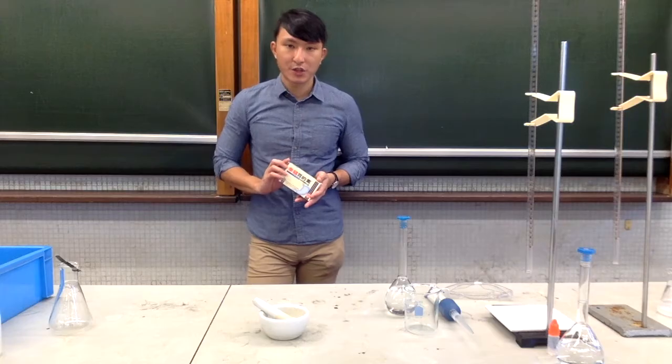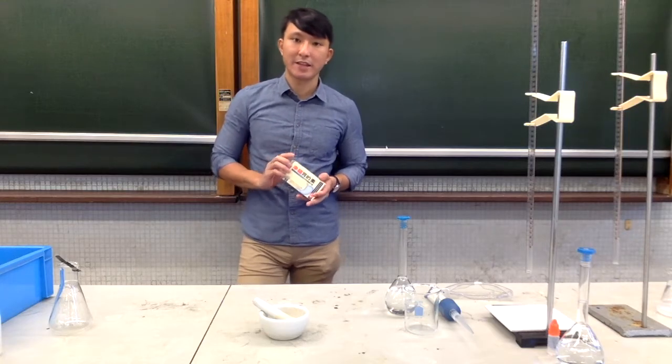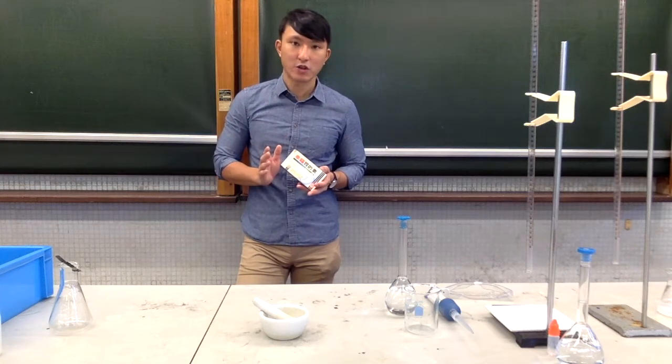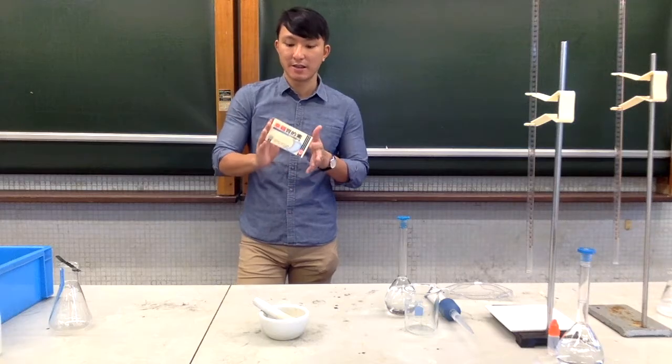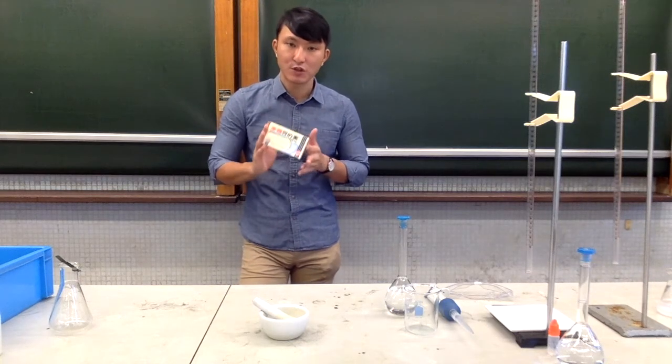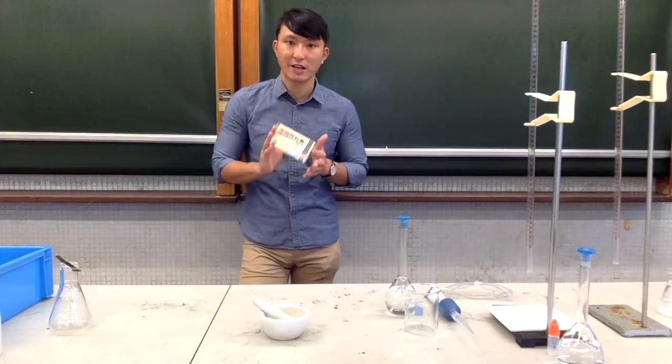In this video, I'm going to show you the experiment of determining the mass of aluminum hydroxide present in a brand of commercial antacid tablets using the technique of back titration.